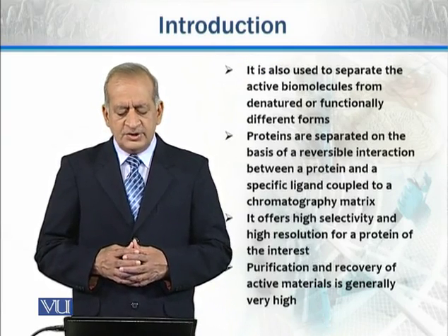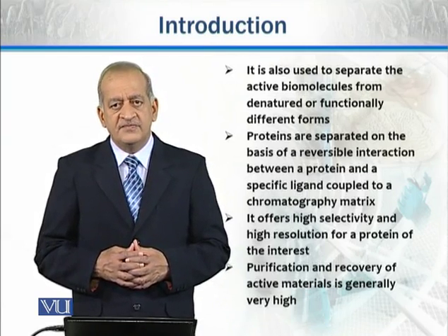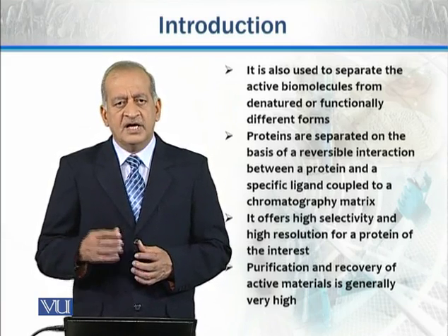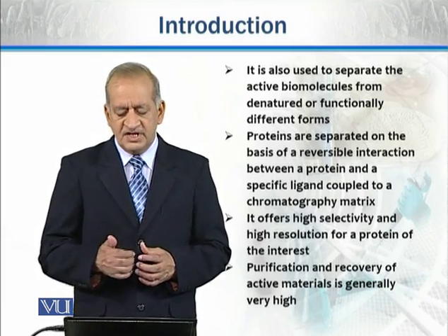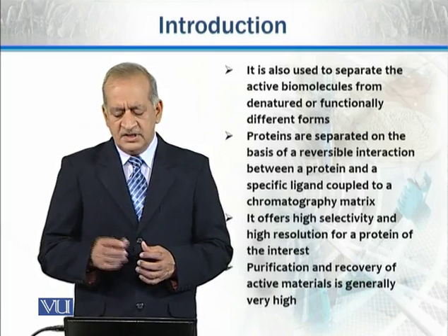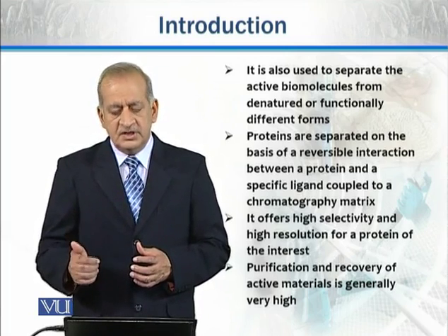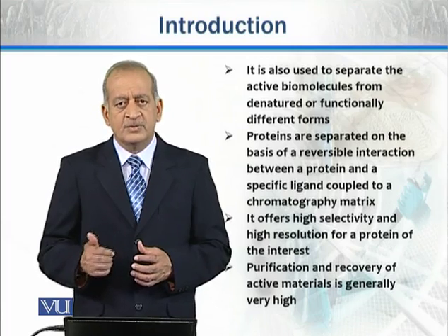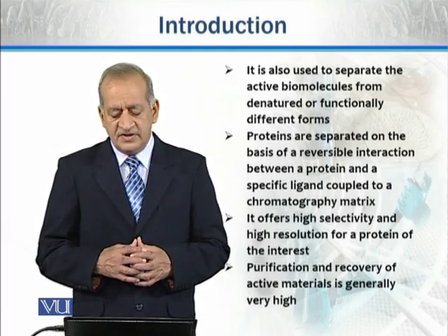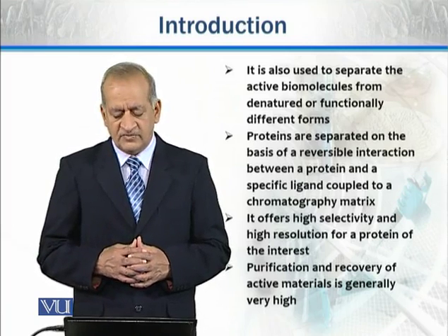This technique is also used to separate active biomolecules from the denatured or functionally different forms. So there may be different forms of the same compound, and some of the forms may be denatured, or they may be functionally different from the functional form. So what happens with this technique? We use it to separate the denatured form from the normal or functional form of the compound.